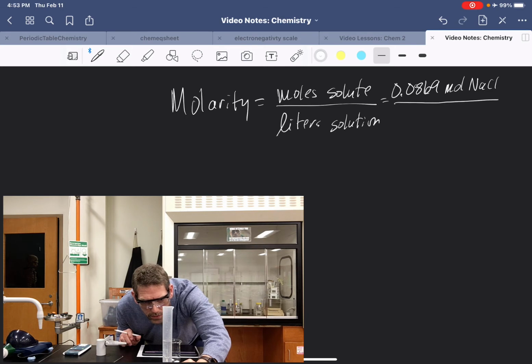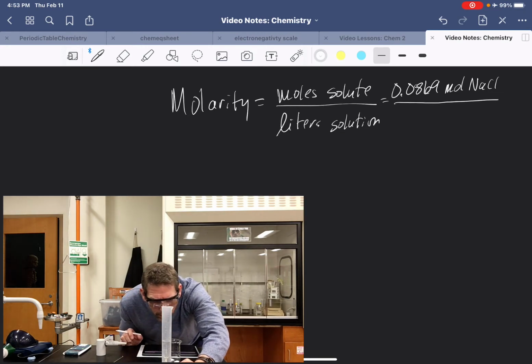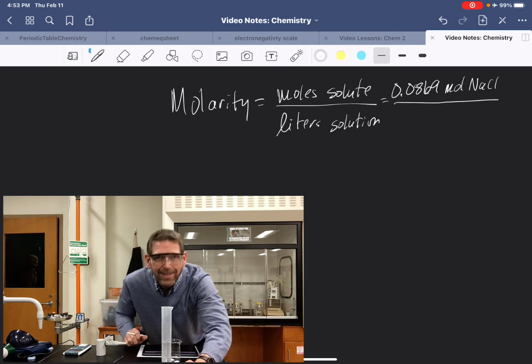This particular graduated cylinder that I have, each of the graduated lines, the tick marks on there, counts for 1 milliliter. And the meniscus on this one is between 64 and 65. It's kind of in between. I'm more eye level with it. I'm looking, I got lower and I realized I was looking at it wrong. I'm going to go with 67. It's at the 67 milliliter mark.